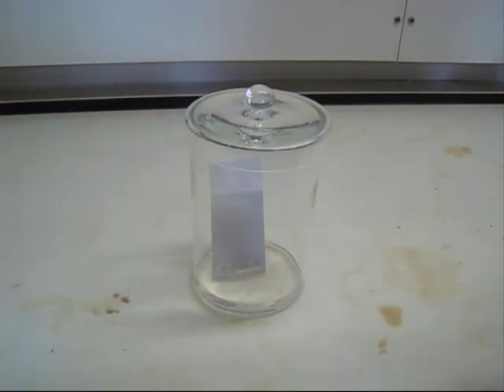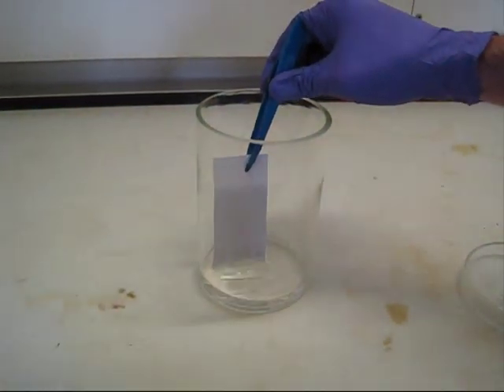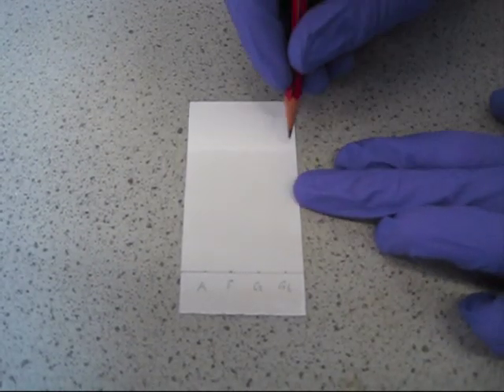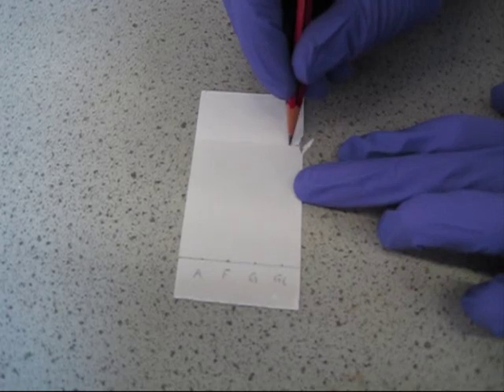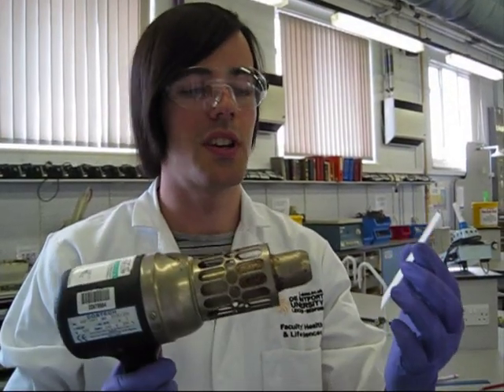Once the plate is finished running, remove it from the tank. Mark the solvent front with a pencil, and then dry with a hot air blower.